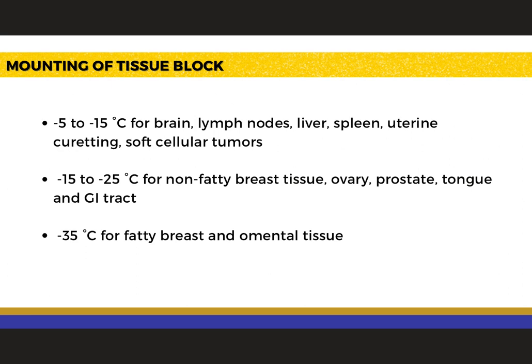Moving forward to mounting of tissue blocks. Synthetic water soluble glycols and resins are generally used as mounting media for tissue blocks that need to be sectioned on a cryostat. OCT, or optimal cutting temperature compound, from the Labtech Products Division of Miles Laboratories Incorporated, is especially recommended. It is marketed in a convenient 8-ounce plastic dispenser in three temperature ranges depending on the tissue being cut. So you need to remind yourself of the following temperatures.